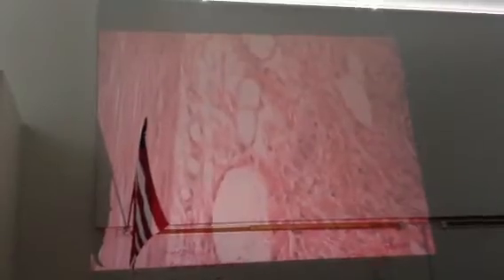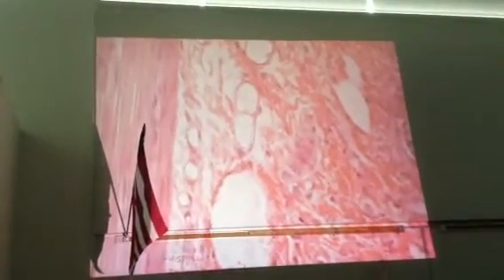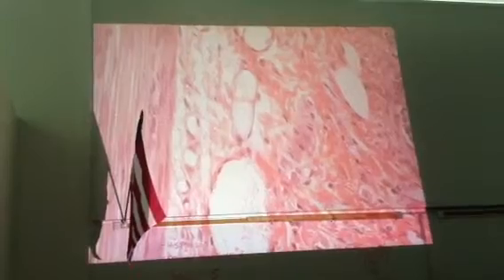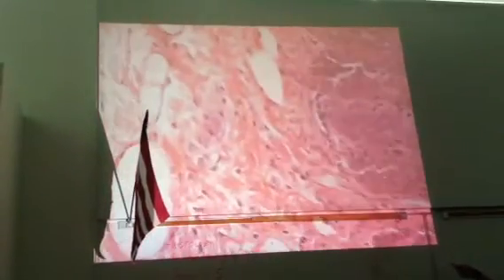And then we come over to the submucosa. It's dense irregular connective tissue. Blood vessels abound. We also have some fairly large cell bodies of autonomic nervous system neurons, but they're not on your list, so we're not going to worry about it. Dense irregular connective tissue and a lot of fibroblasts.